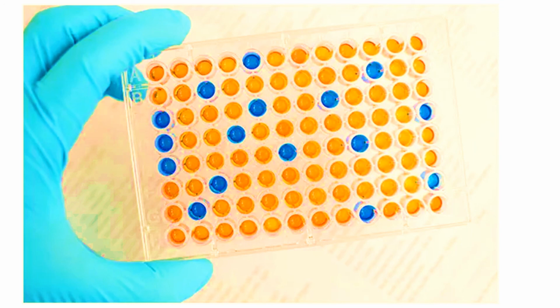So this is an indirect ELISA. Here you can see before the addition of your serum sample, and this is after the addition of the serum sample. You can perform it for qualitative estimation, and we can also use this indirect ELISA for quantitative estimation.